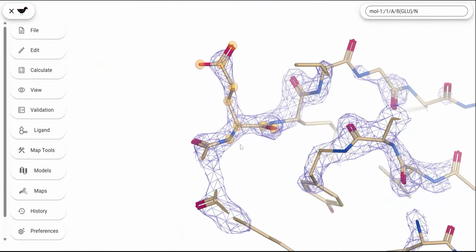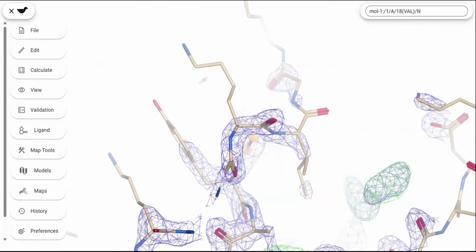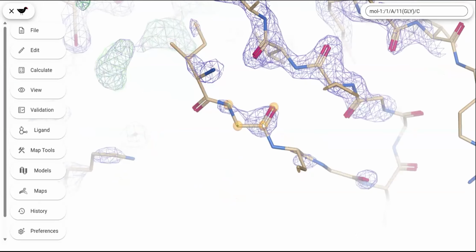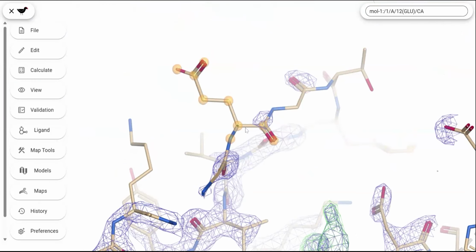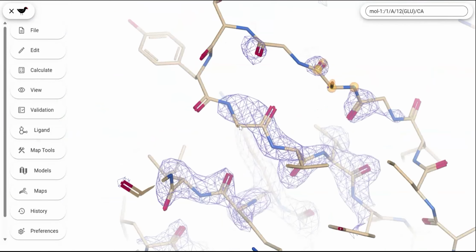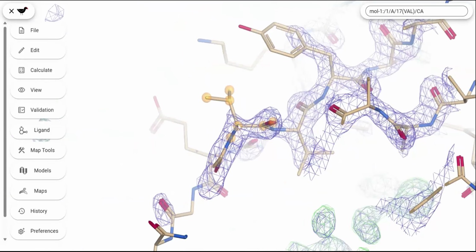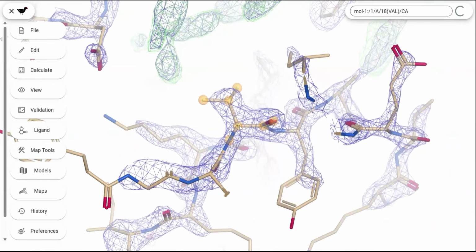This blue is the nitrogen. This first beige is the C alpha because it's the carbon where the chain comes off. It always comes off at C alpha. And then C prime, which is the carbon that's double bonded to the oxygen. N, C alpha, C prime. And as long as you're going in the N, C alpha, C prime direction, then you are going down the protein sequence. So as we advance some more, we see that the sequence is now at residue 16, now it's at residue 17, residue 18, residue 19.